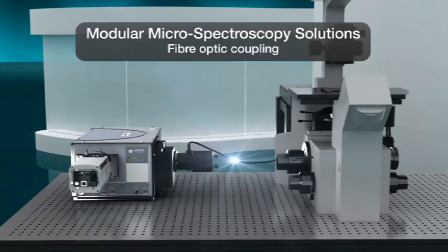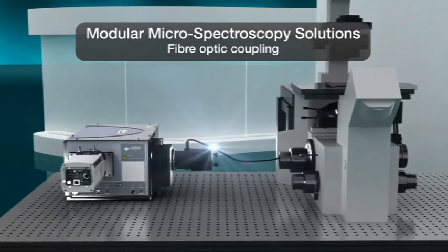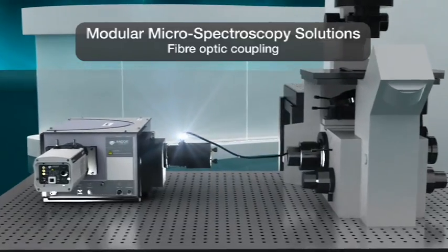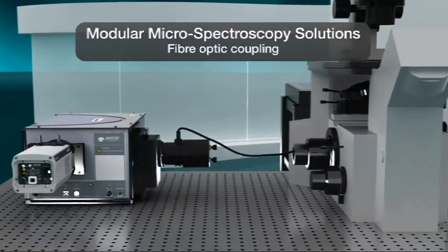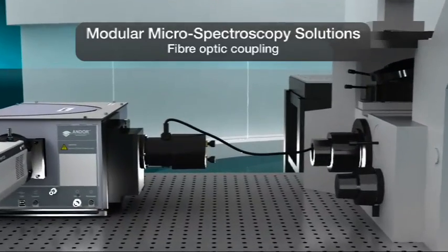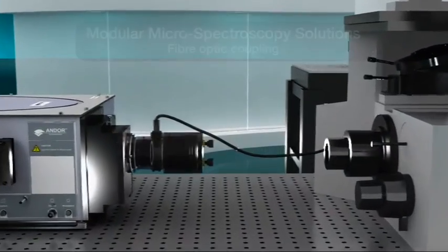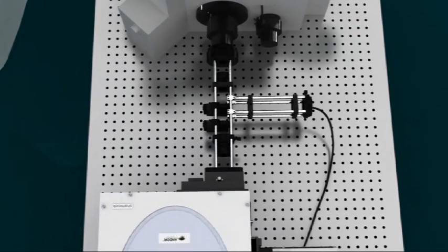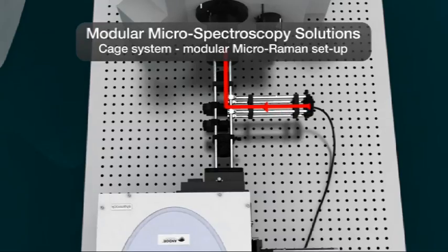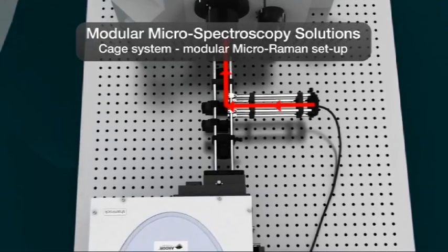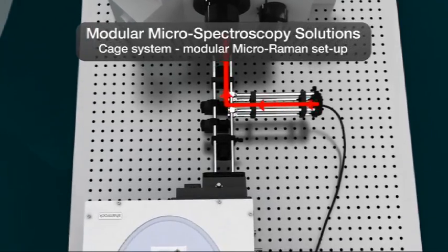Spectral information from a broad part of the sample can be collected by a simple fiber optic or through more complex modular setups based around the ever-so-popular CAID systems easily configurable for micro-Raman or micro-luminescence spectroscopy.